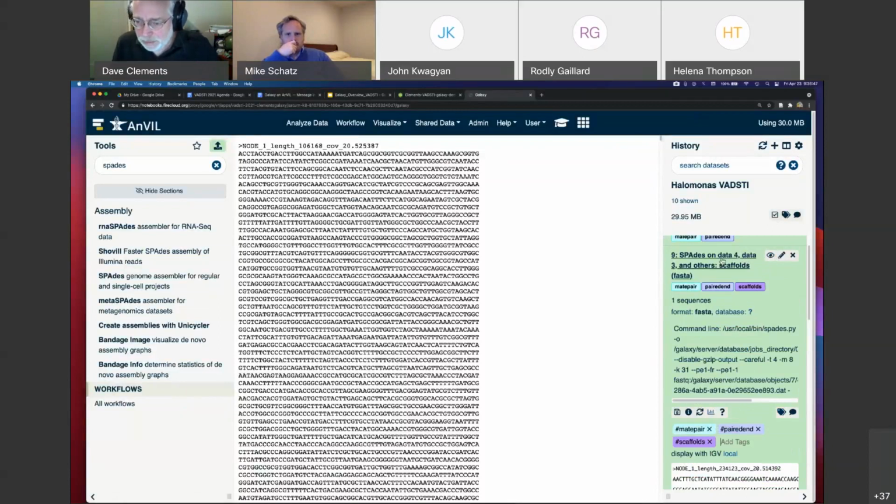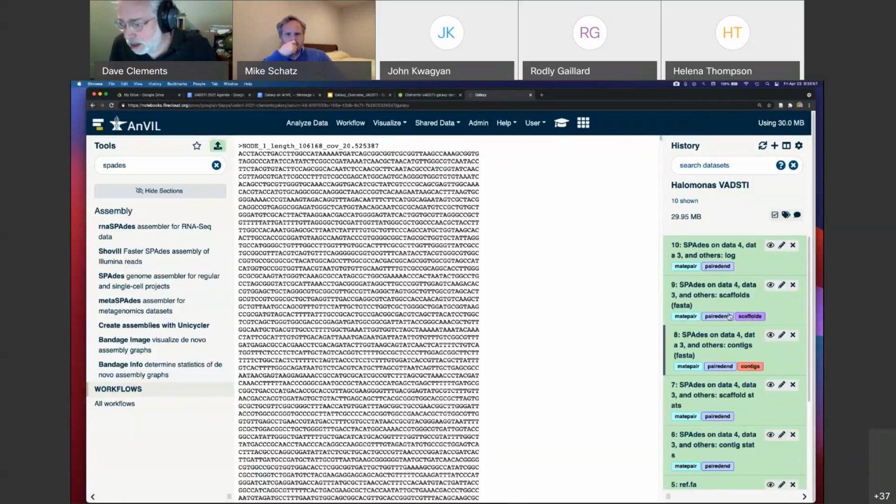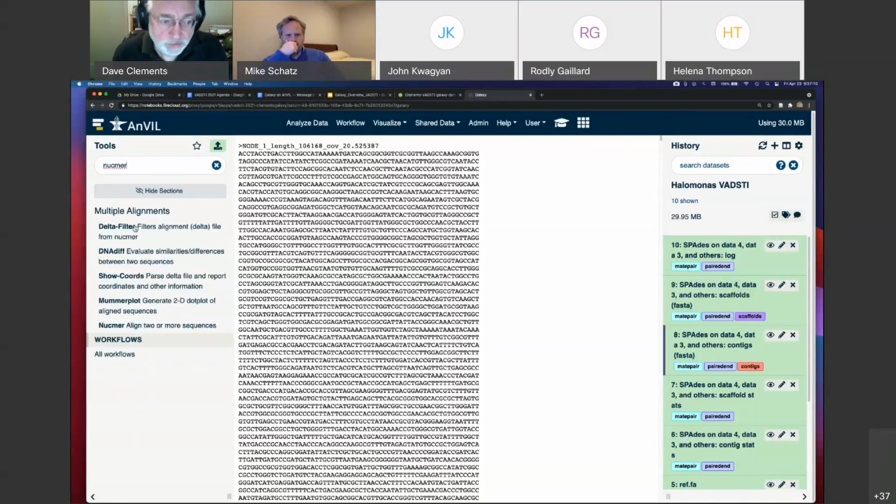If there are questions, somebody let me know. Okay, good. So we've got our assembly, and it produced 4 contigs. Now we're going to use something called NUCMER, N-U-C-M-E-R, to visualize what we got.